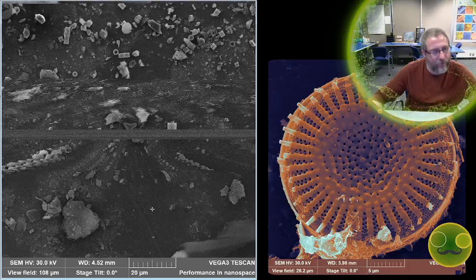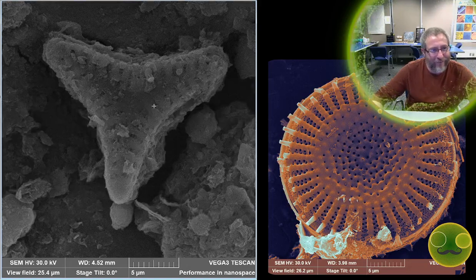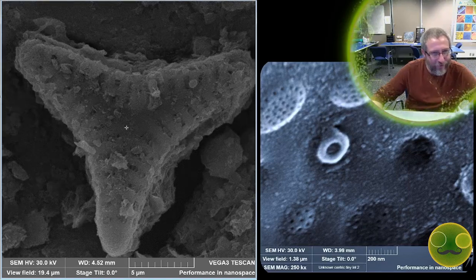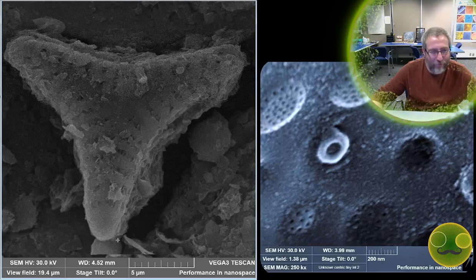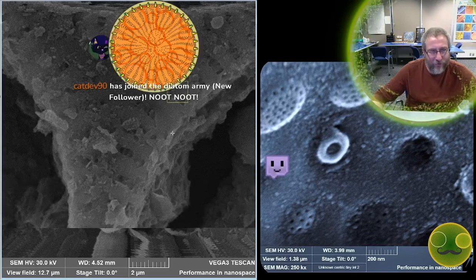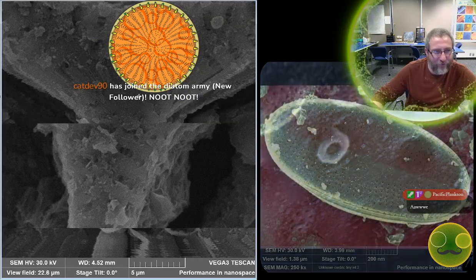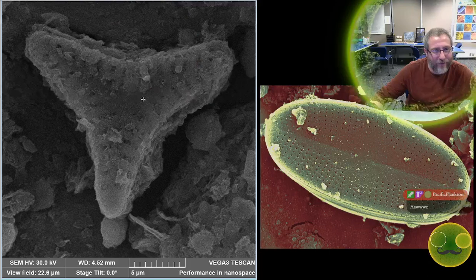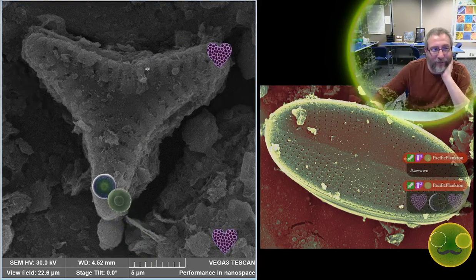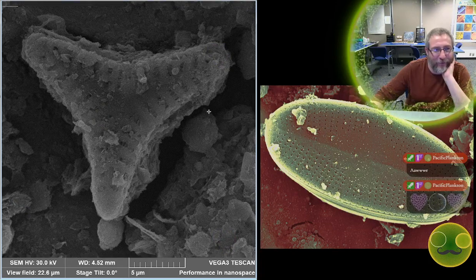What is this? It's a triangular diatom. Aww. It's a fragilarioid of some type, I think. These are super uncommon. I find them sometimes in lake sediments. Yeah, I think it's some sort of Fragilaria. You almost never see them triangular shaped like this. I don't remember the name of the species in Fragilaria today that are like this, but this is a 10 million year old sample, so it's probably not the right name anyway.